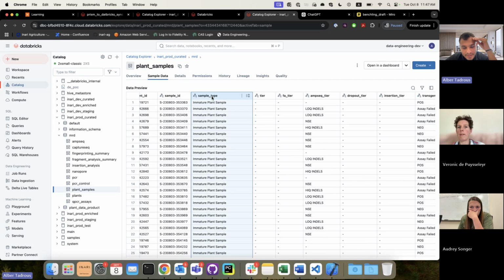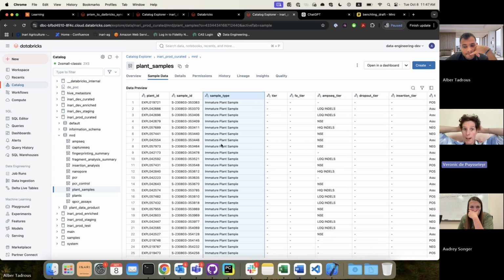Yeah, but we have this column called sample type. In this situation, we can add protoplast. So let's say that you have a protoplast, and in the sample ID you fill out the protoplast identifier. Exactly. But then in the plant ID column, you should fill out the protoplast experimental condition. So you should maybe rename the column or add an additional column to fill out, because that's not a plant, eh? A protoplast experimental condition.